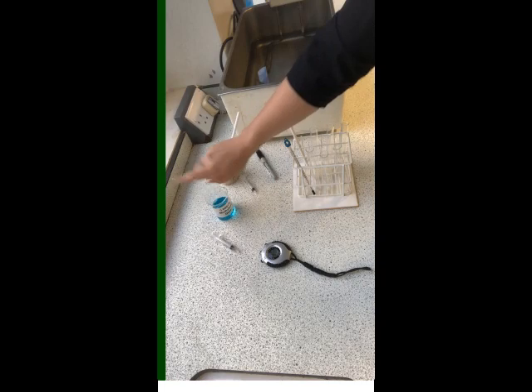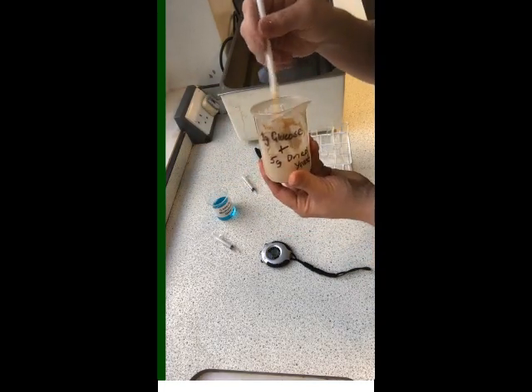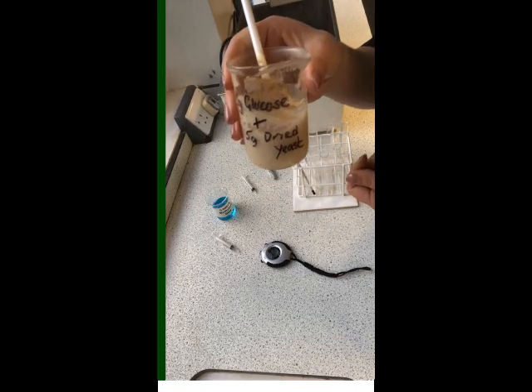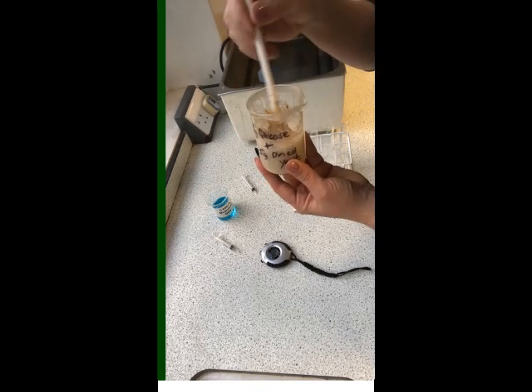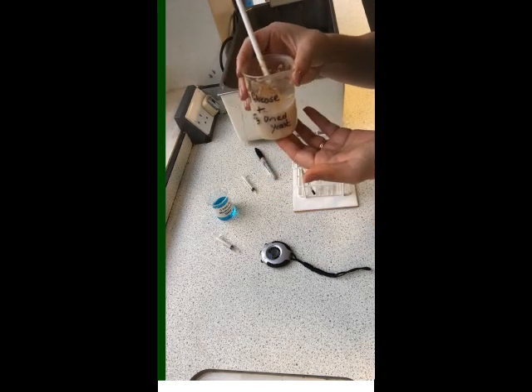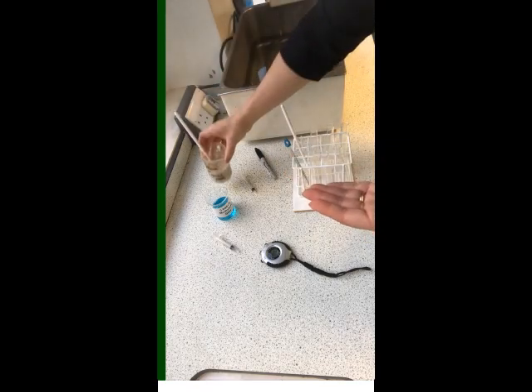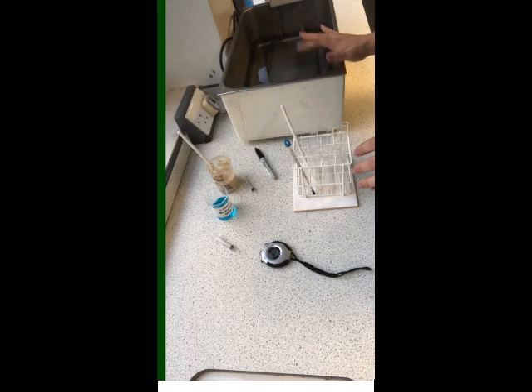So we have got methylene blue. We have got a solution of glucose, so we've got a respiratory substrate there, with yeast. That's been made into a solution, as I've said, with some water, and it's been kept at good optimum temperature in an incubator. So it's been kept at around about 37 degrees Celsius. So it's nice and active. We have also got an electronic water bath set to around about 37 degrees Celsius. That's going to be one of the temperatures we're going to investigate.